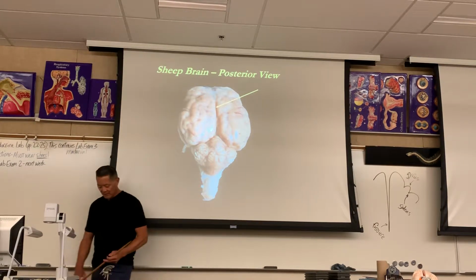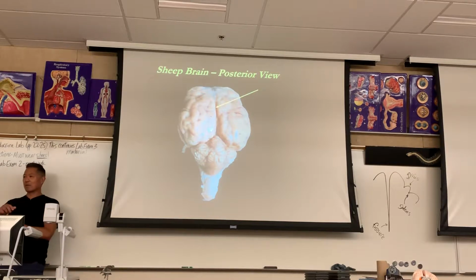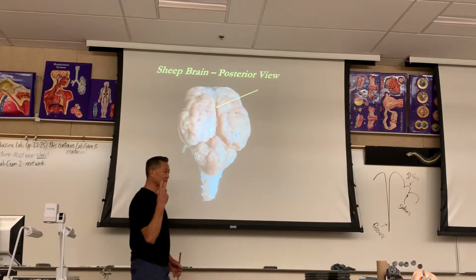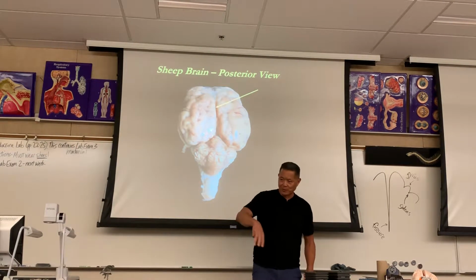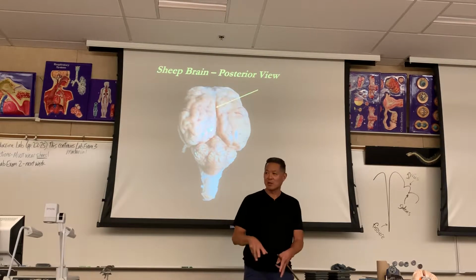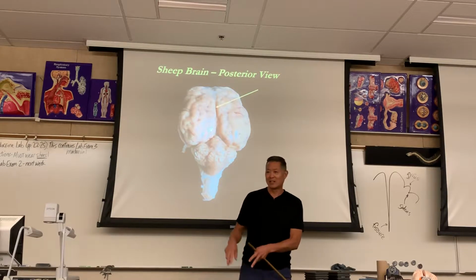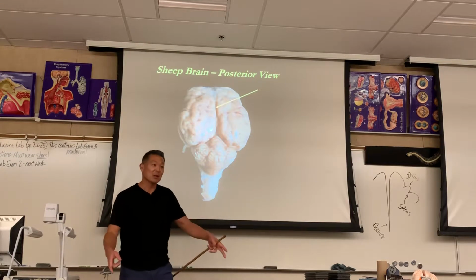But there'll be a third of you doing external, and those that do external, I'm going to split you up, since you have 3 different types of dissections: external, sagittal, coronal. In each group of 3, I'm going to split you up. So once you've been checked out in those lists of structures, you've got to show the other 2 groups the external structures. Sagittal's got to show the other 2 groups of sagittal structures. Coronal's got to show the other 2 groups of coronal structures.